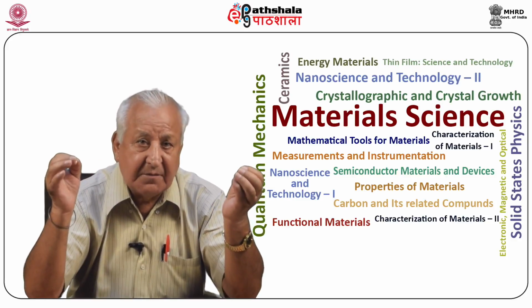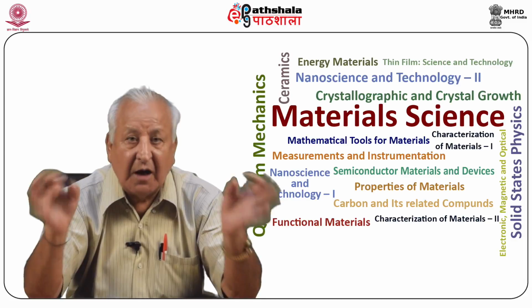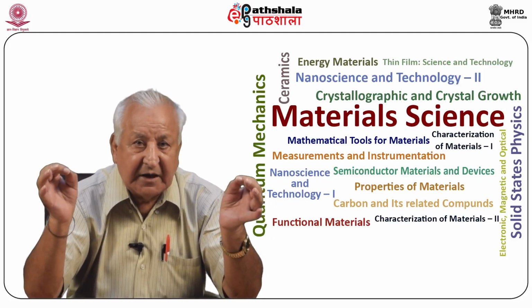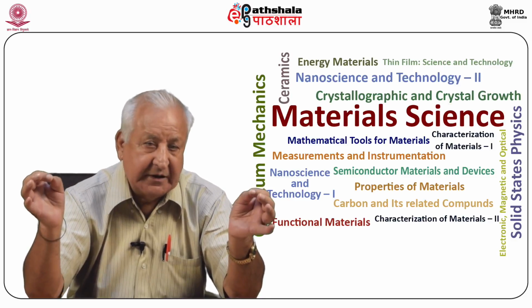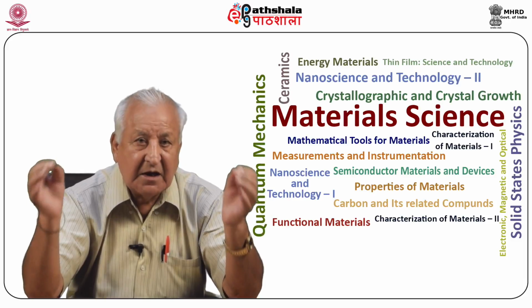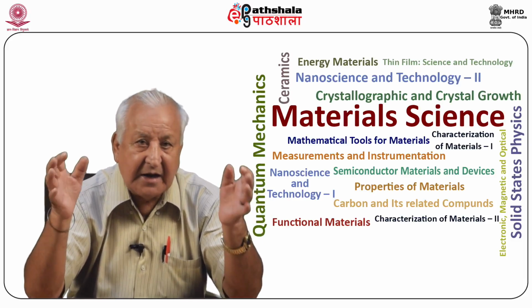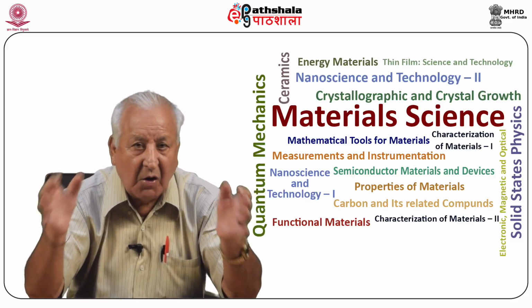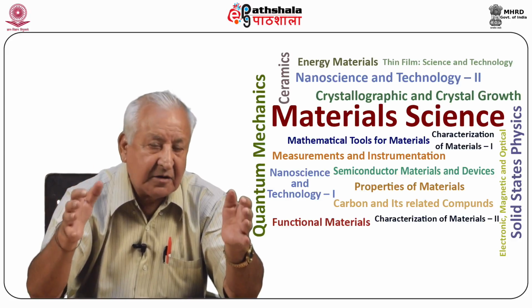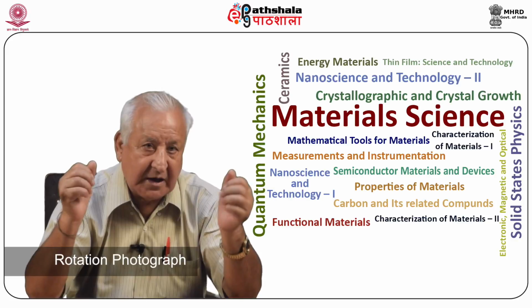The rotating crystal method was devised by Schiebold and Polanyi. Its principle is based on the fact that if a crystal is rotated slowly about a fixed axis, a large number of planes will successively come into the reflecting positions, and the diffracted radiation falls onto the photographic plate or film in the form of a pattern of spots, popularly called a rotation photograph.